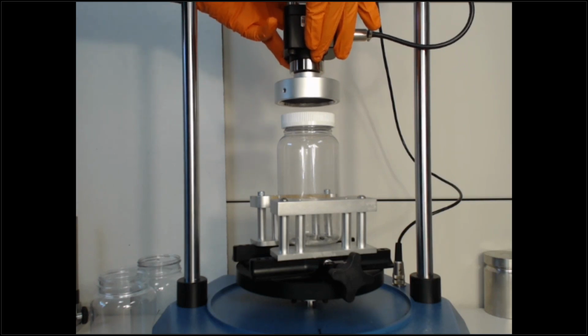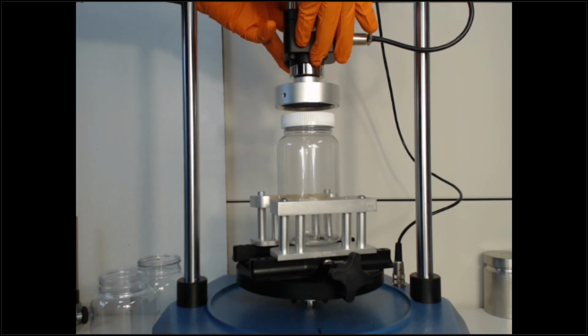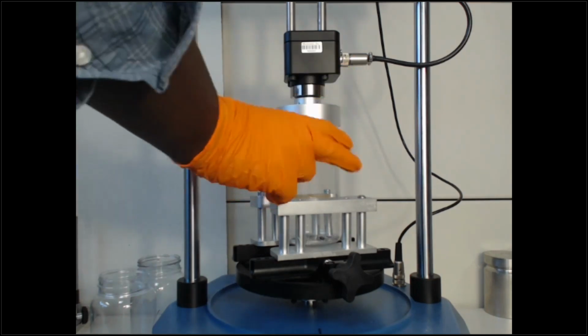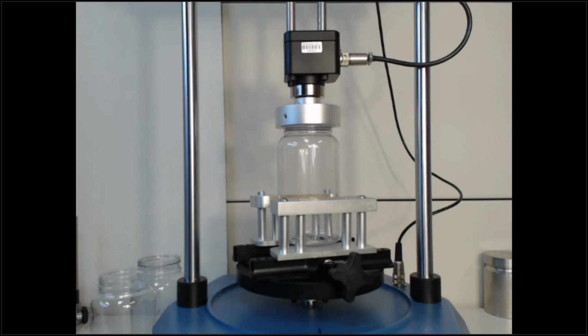The machined chuck has teeth that are serrated, and so they mate with the actual cap. One of the reasons this is a preferred method is that we're not relying on operators to guess how tight they're tightening the caps and so on. All operators are going to do the exact same thing, the exact same way each time. And then on the base, obviously, we have several different options for the base, but the key is to prevent the base from slipping or sliding as we're applying torque. So whatever torque is being applied is being measured by that torque sensor.